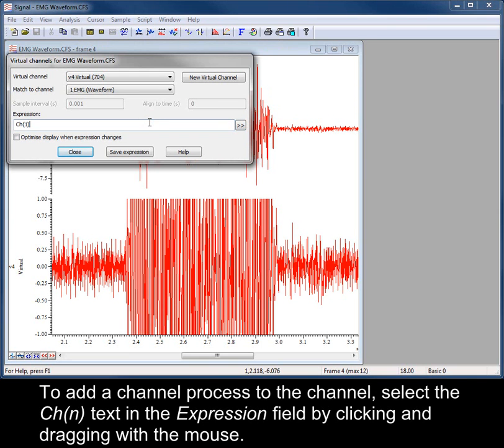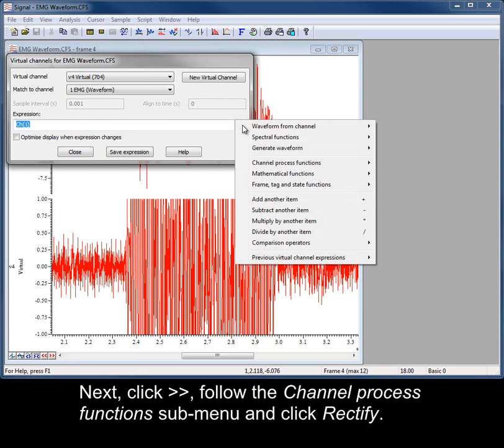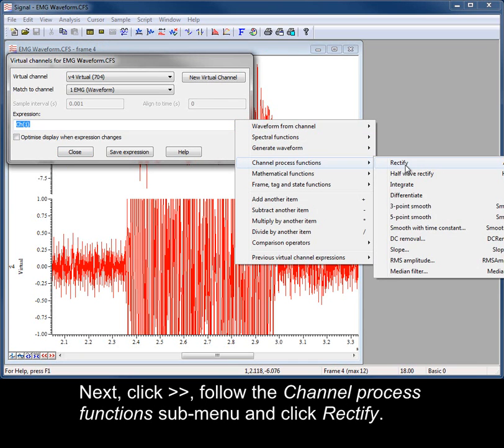To add a channel process to the channel, select the channel expression text in the expression field by clicking and dragging with the mouse. Next, open the expression menu, follow the channel process function submenu and click Rectify.